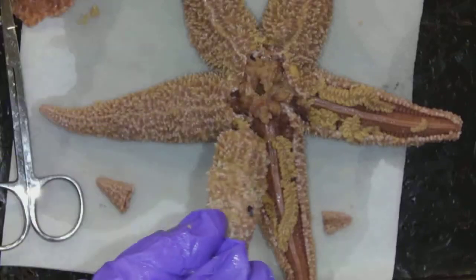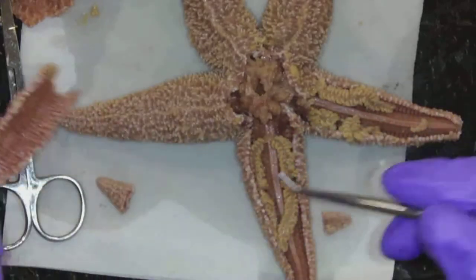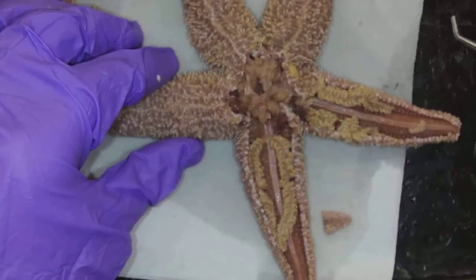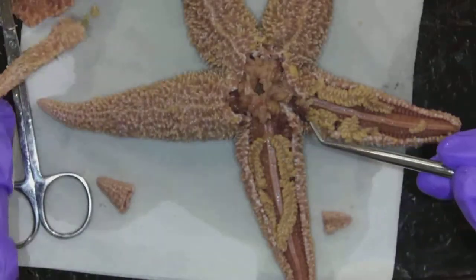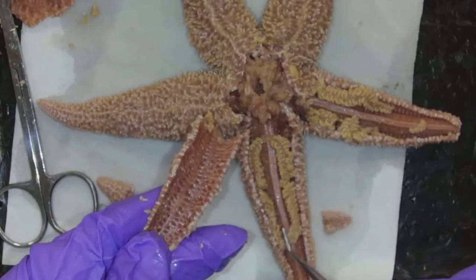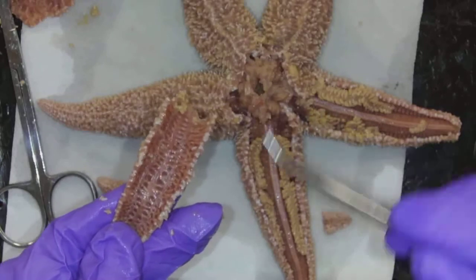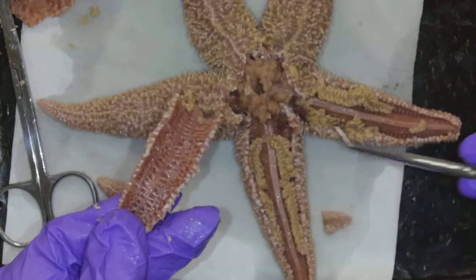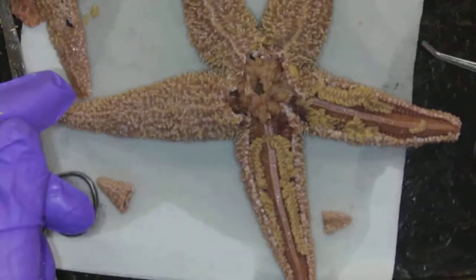You can see now that I have removed that outer layer with the endoskeleton off of two of the arms and the central region, so now we can start to see some structures. Some structures started to cling to the inside of that endoskeleton, so I had to very carefully lay them back down, and they got a little bit destroyed on this side. But that's okay — I always do two arms, because pretty much every arm is exactly the same, a repeat of five different things, so I do two arms so that I can show all the structures.